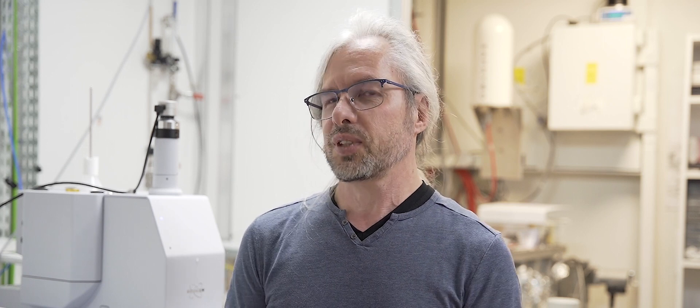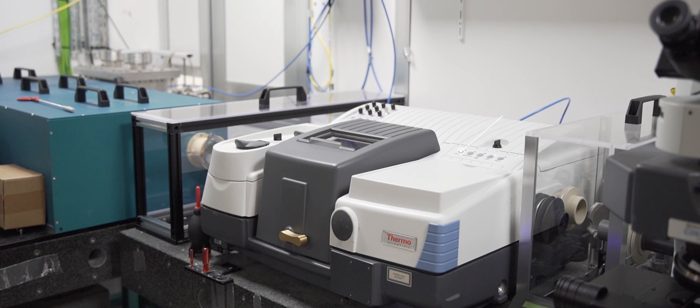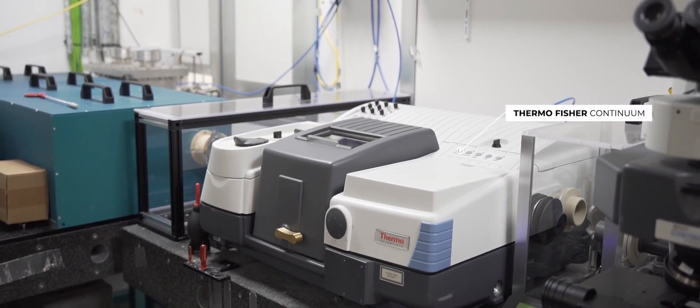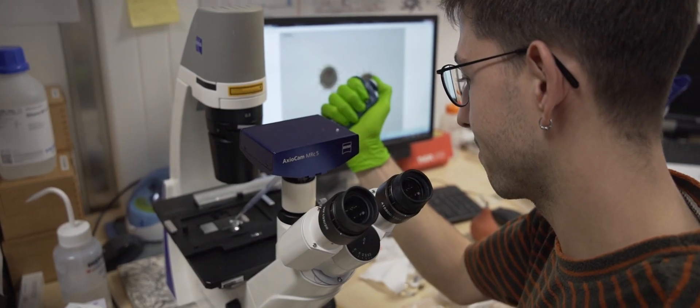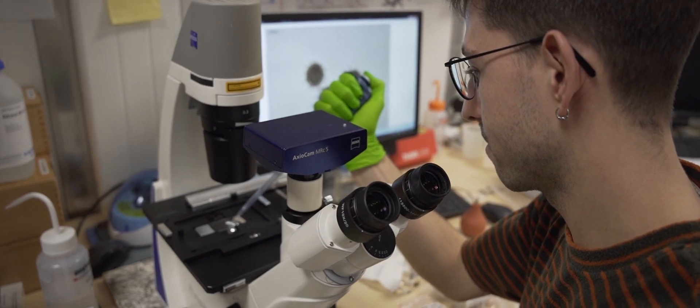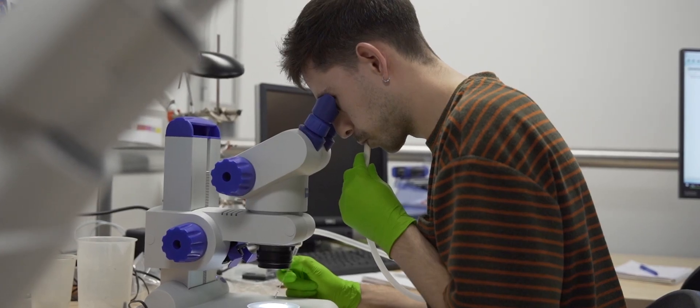I'm Christophe Sand. I am a beamline scientist at the Smith beamline. I'm particularly in charge of biospectroscopy, using infrared microscope to study biological samples. There are two types of samples that we mainly use: 2D cell cultures or tissue sections. We are able to extract quite a wealth of information from these biological samples.